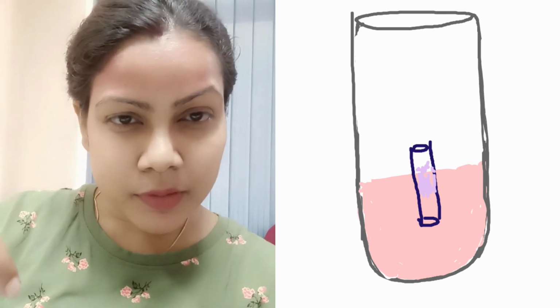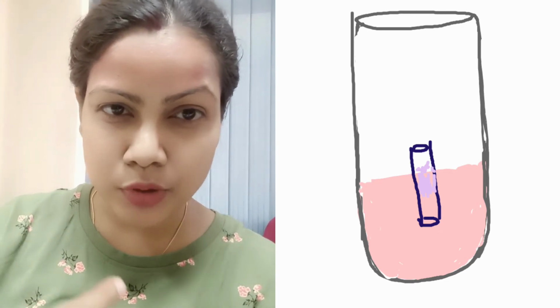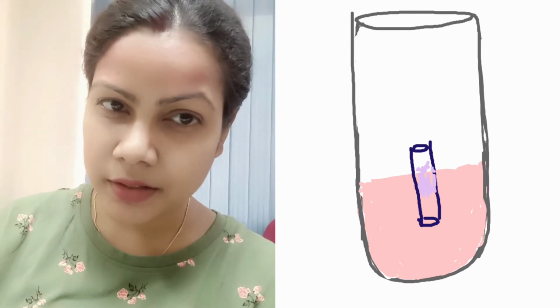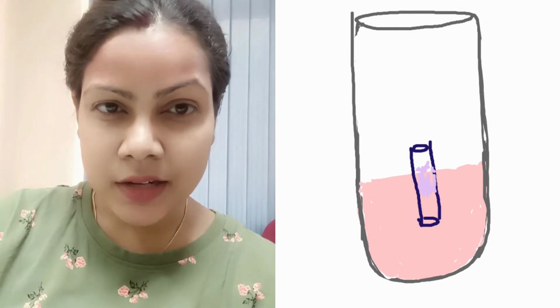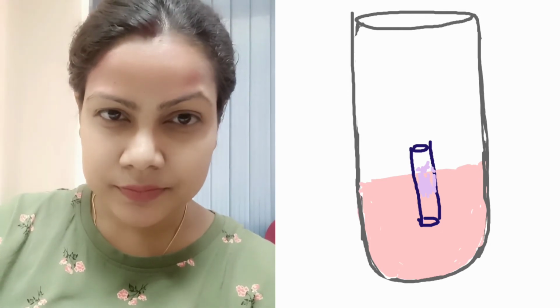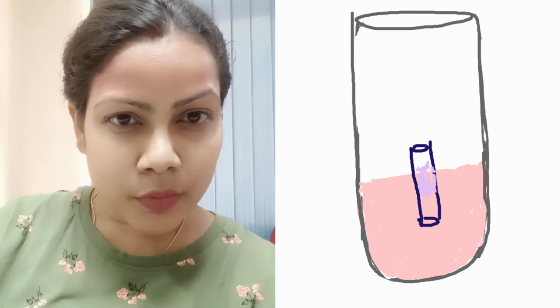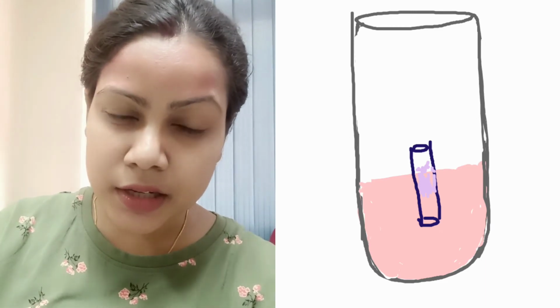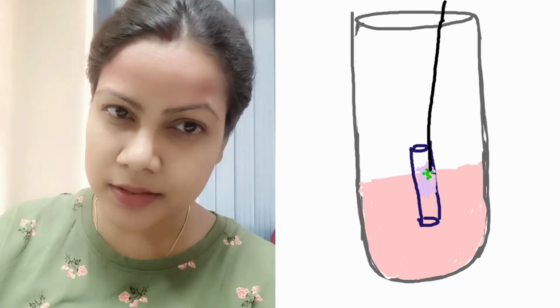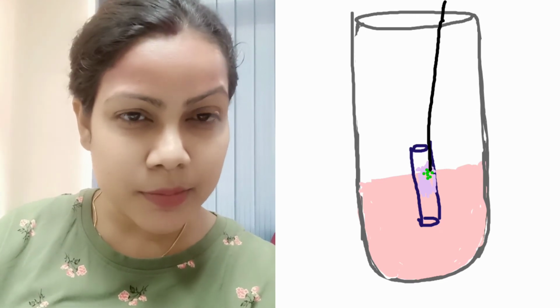We place this Craigie tube inside the bigger test tube containing culture media. Then, for the bacteria we need to test for motility, that is, the presence of flagella, we take a small colony and inoculate it inside the Craigie tube, which contains semi-solid media.